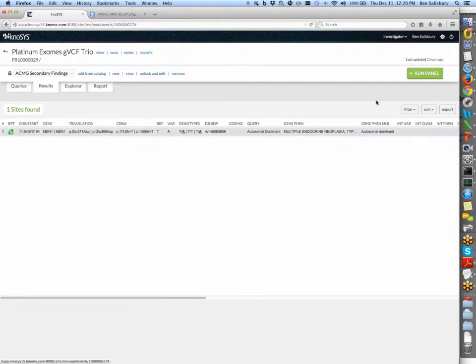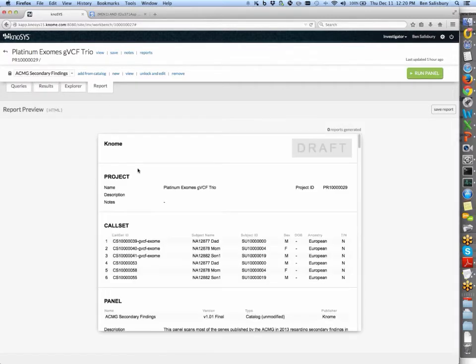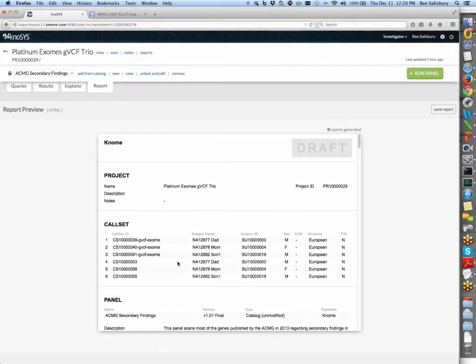There are two ways to get variants out of the system. One is to export this table in a tab-separated values file format, something suitable for opening up in Excel. There's a lot of delimiting in there if you wanted to parse out data secondarily. Another way to get data out is to use our new reporting feature. This takes all of those variants that were marked for reporting and summarizes them. This is effectively the same information we just reviewed, including records of everything that was done.